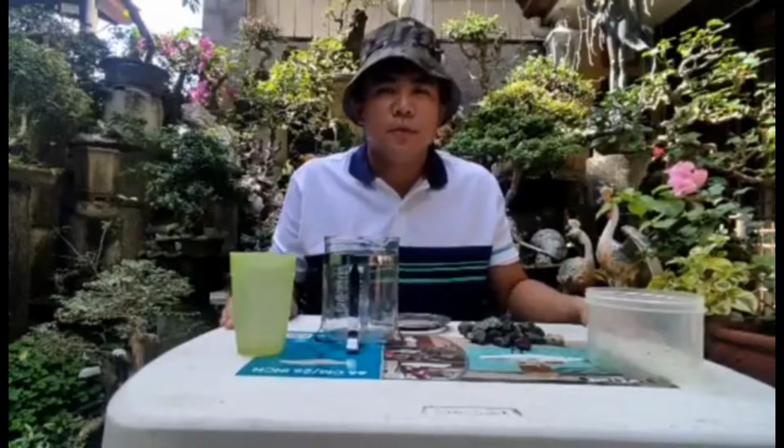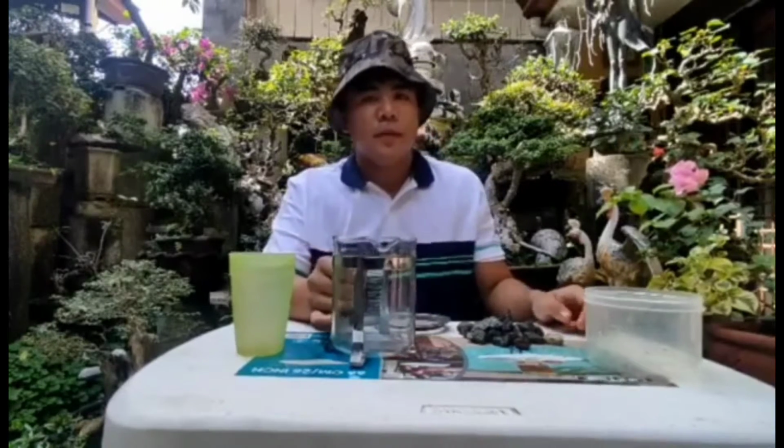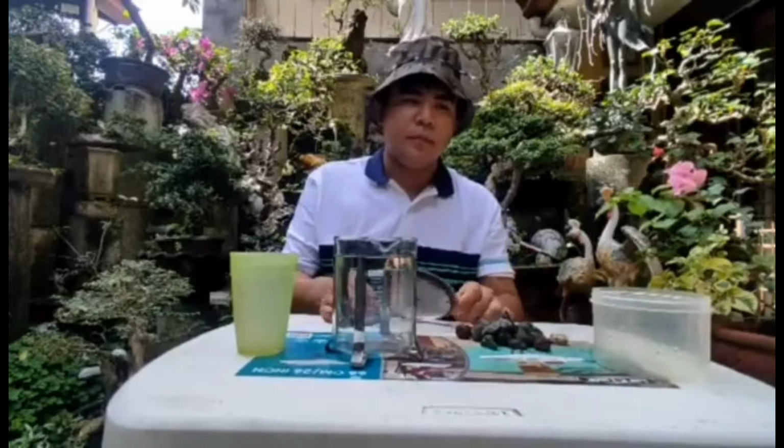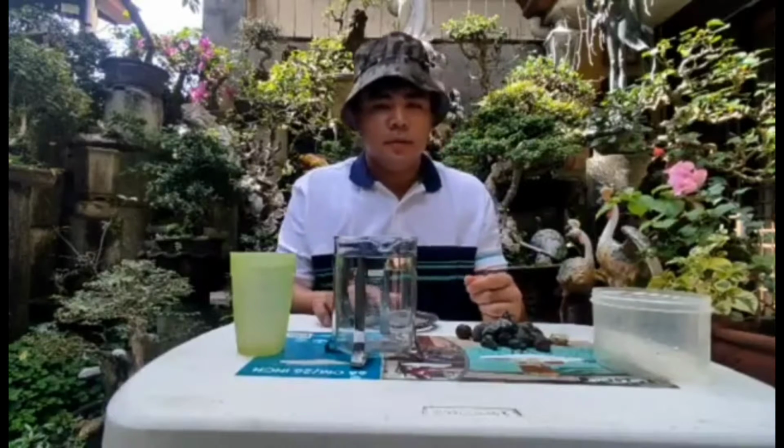Good morning everyone. I'm Johan from Group 2 and today we're going to demonstrate how to separate water and gravel. The materials we are using are the following: an empty beaker, an empty container, a bunch of gravel, a wired filter, and that's all.